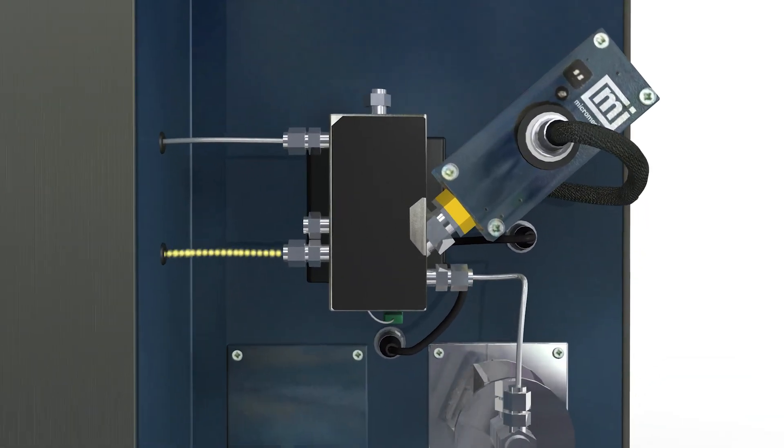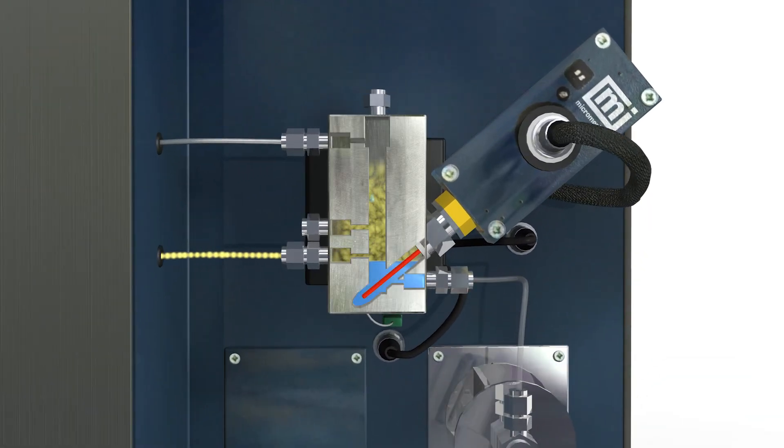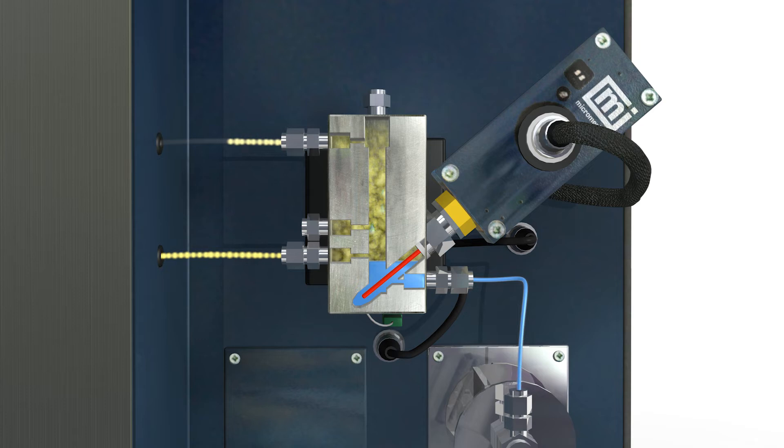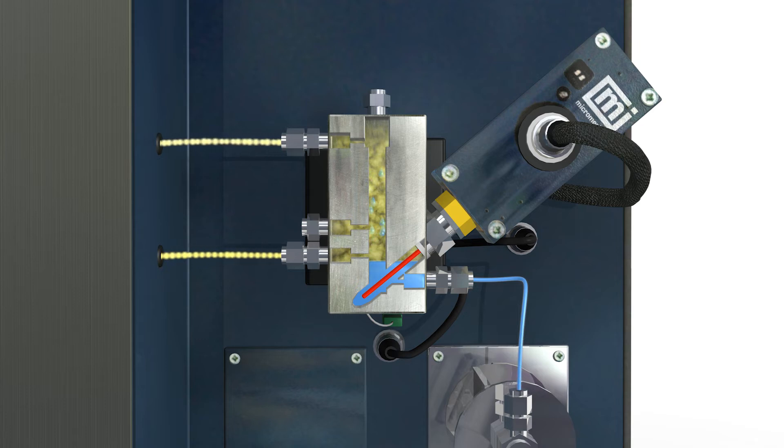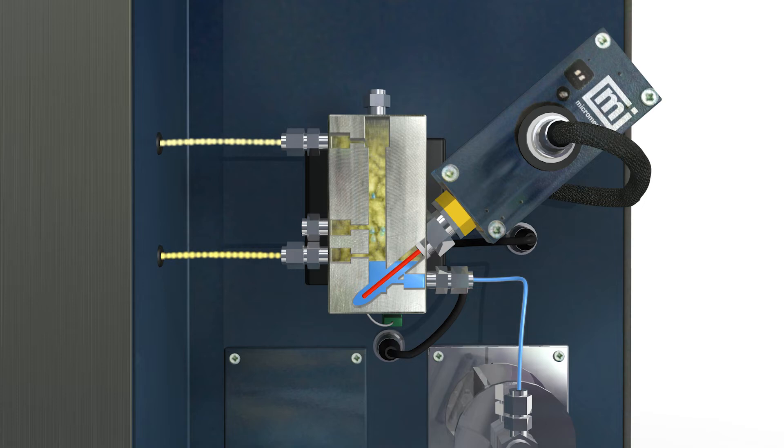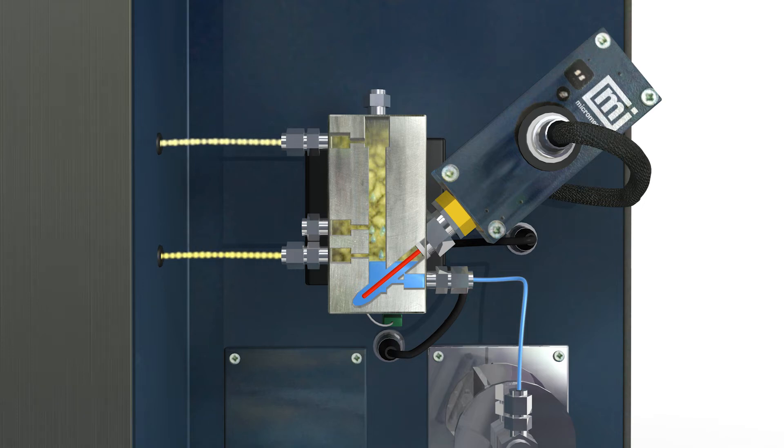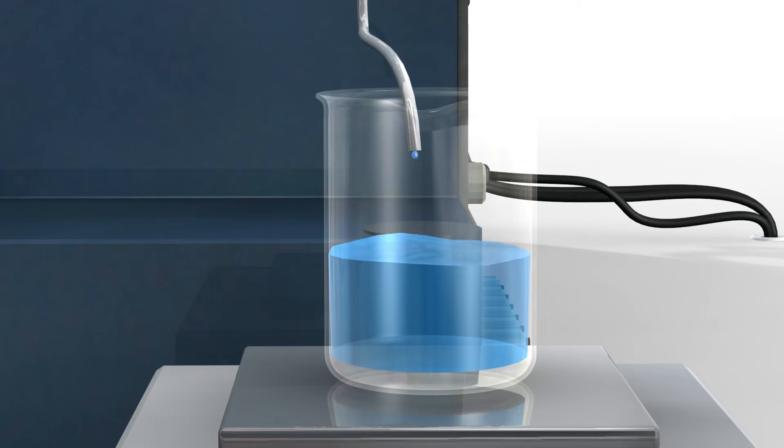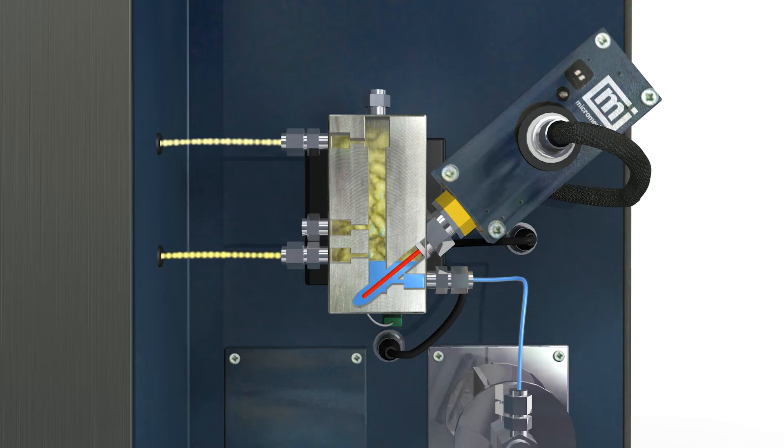The product is a mixture of vapor and gas under pressure and flows into the liquid gas separator. The separator is cooled by the Peltier elements down to a temperature of approximately 4 degrees Celsius. The vapor becomes liquid and the gas remains in a gaseous state.